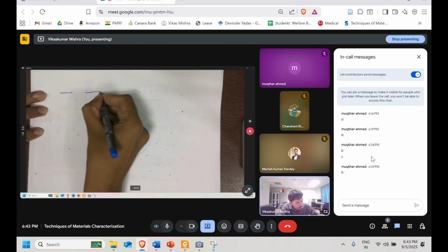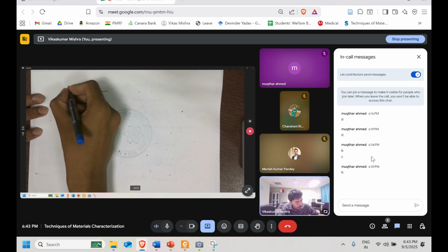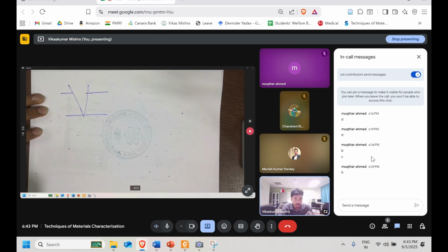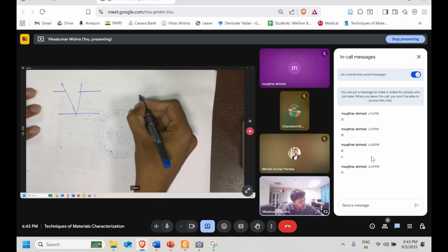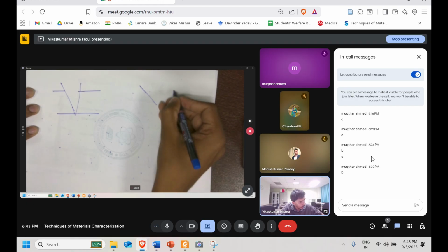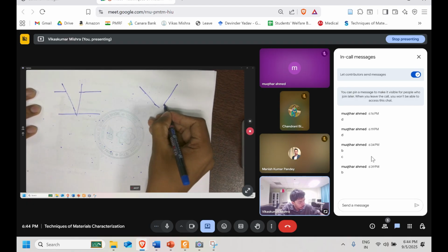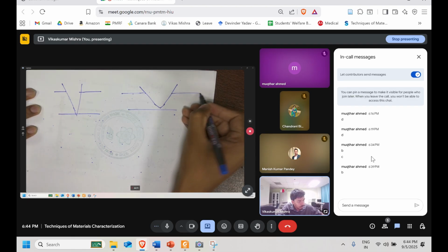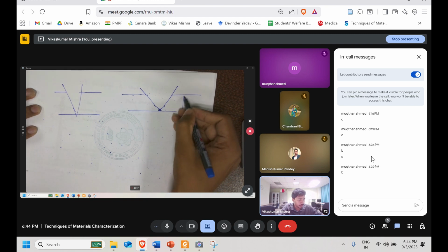If the lens is over here, if this was the objective lens, and this is the specimen, and we are getting some signal. Sorry, we are passing the electron beam. This is case 1. In case 2, what we did, we decrease the working distance. Now, according to that, it will focus at this different point, because now the distance has decreased.